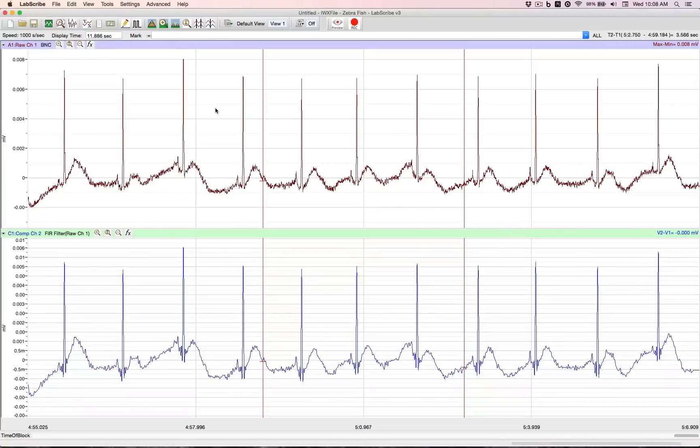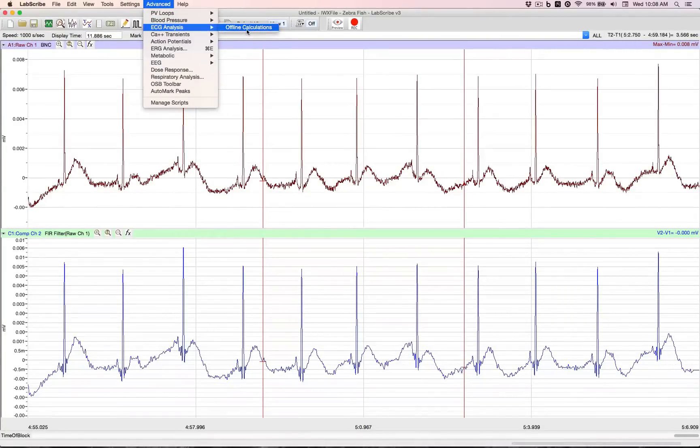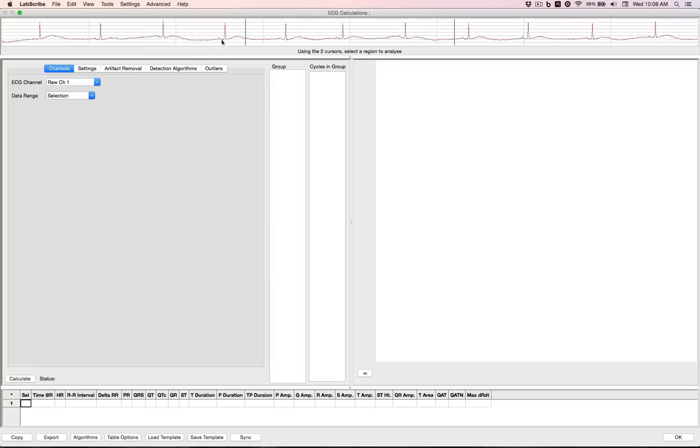While the fish is recovering, let's go analyze our data. Go to Advanced, ECG Analysis, Offline Calculations. In the window, we set the channel we want the data to come from. We're going to set the whole block of information.